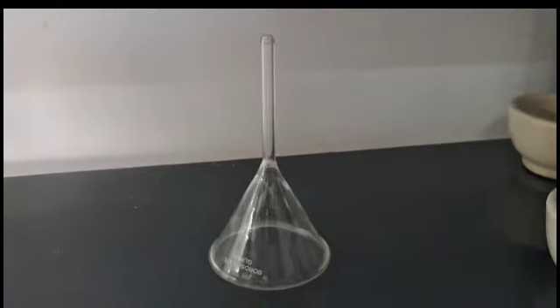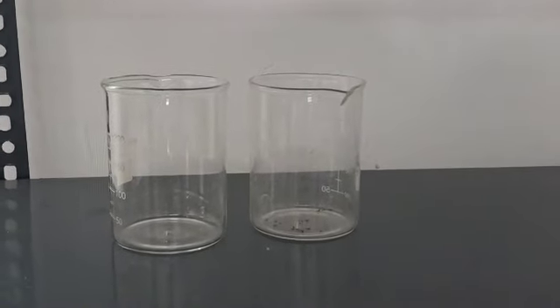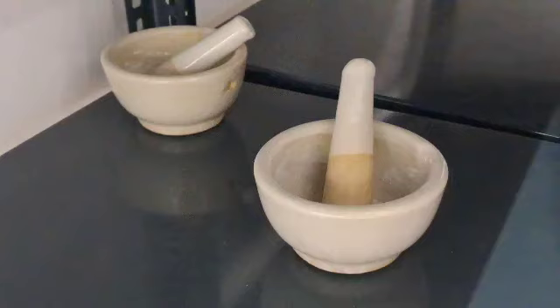The apparatus required are glass rod, measuring cylinder, funnel, beaker, tripod stand, mortar and pestle, and filter paper.